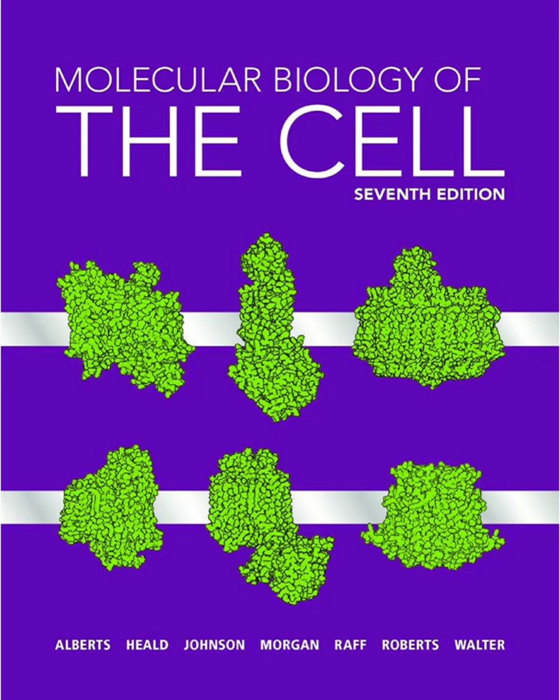A more integrated approach, especially for high-resolution correlation, involves techniques like FIB-SEM, focused ion beam SEM, which we mentioned. The ion beam milling machine. Right. You might first do super-resolution fluorescence microscopy, like PALM/STORM, on your frozen sample to precisely locate molecules. Then you put it in the FIB-SEM. The ion beam mills away a very thin layer, maybe 5 to 10 nanometers, from the surface of the frozen block. Then the SEM images the newly exposed face. Mill, image, mill, image. Building up a 3D volume, slice by slice.